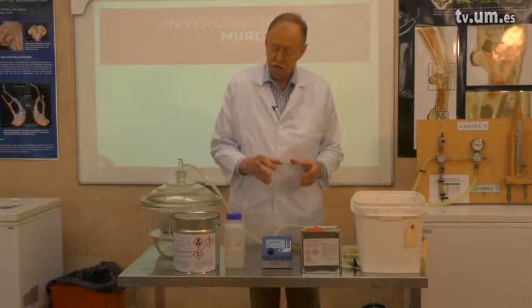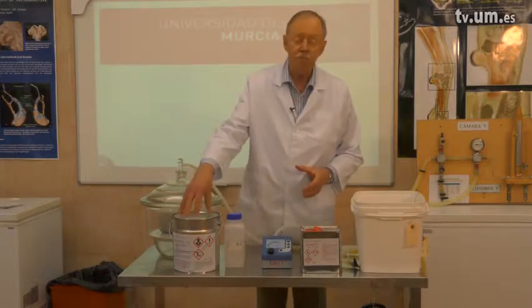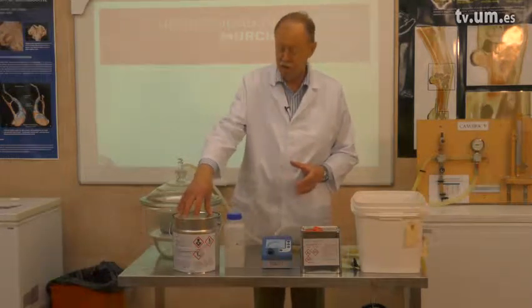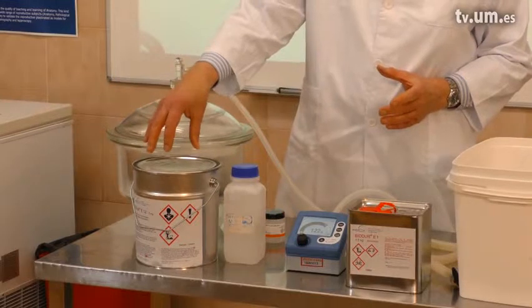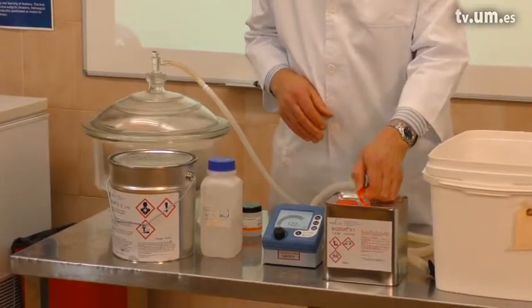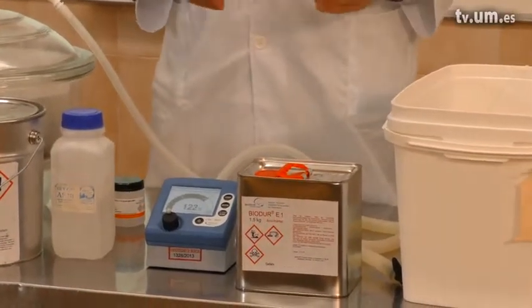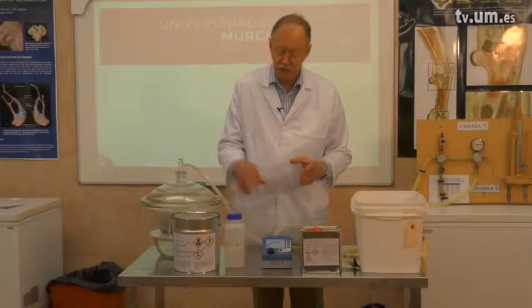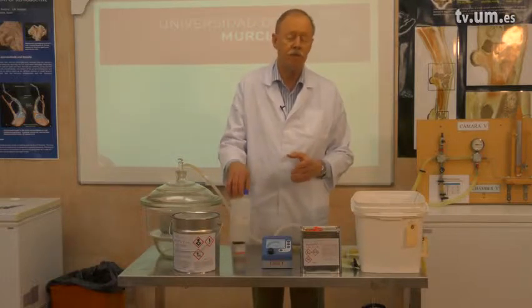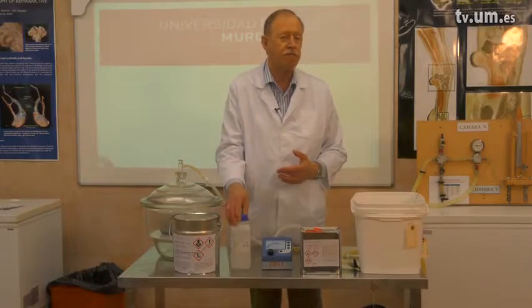The impregnation solution for epoxy uses the epoxy resin E12 — 100 parts by weight mixed with 28 parts by weight of the hardener E1. For prolonged processing time, you can add a softener, EH10, at a maximum of 5 parts by weight.